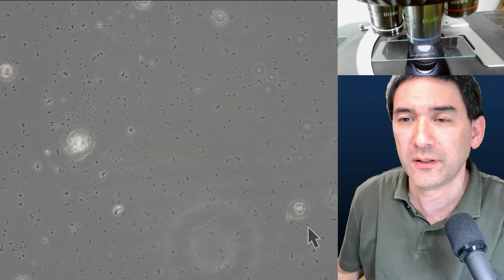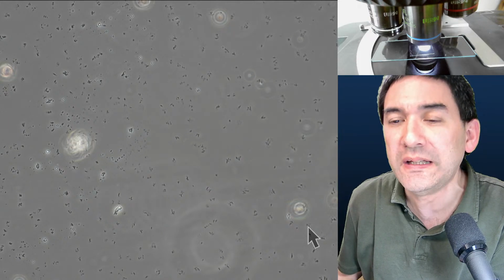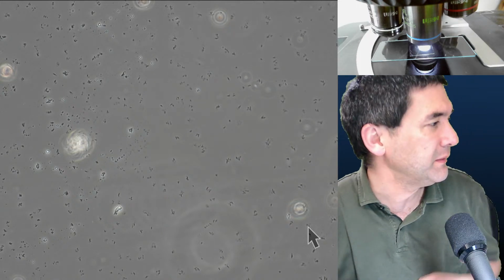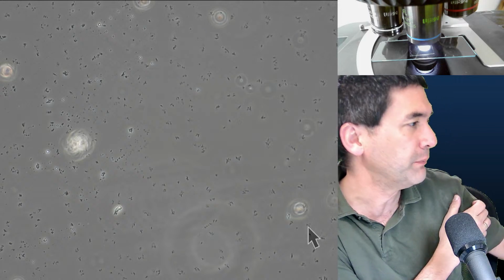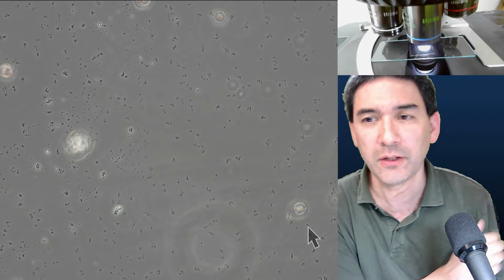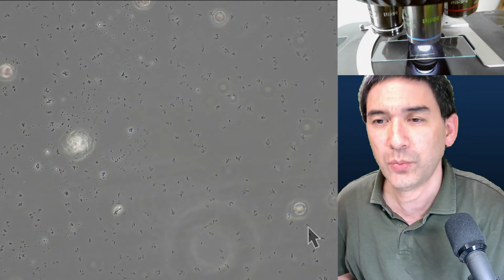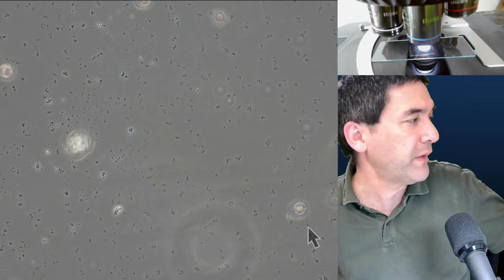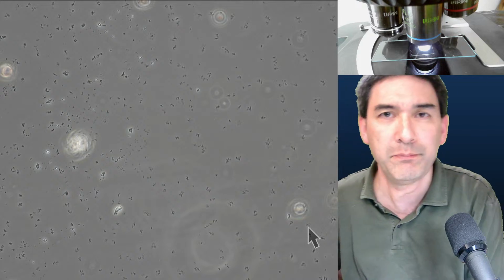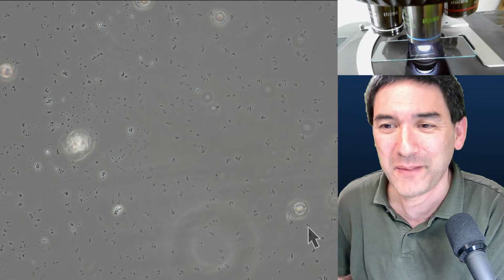Do you have an amoeba or euglena sample? Not euglena, but I do have some pond water over there. But finding an amoeba in there is a little bit a question of luck. So I could find some maybe, but it's probably going to take 20 minutes or so until I'm able to find an amoeba.